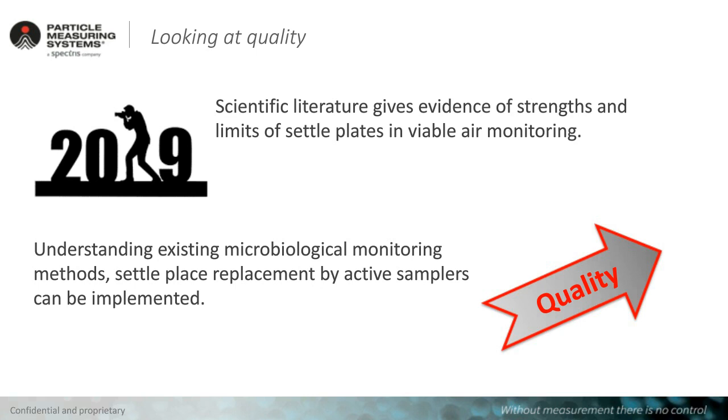So now the question is, how can we use a quality approach in understanding the existing microbiological monitoring methods? How can we understand when we can use settle plates, how can we replace them by active samplers, and how to implement that? This is the next question I'm going to cover.